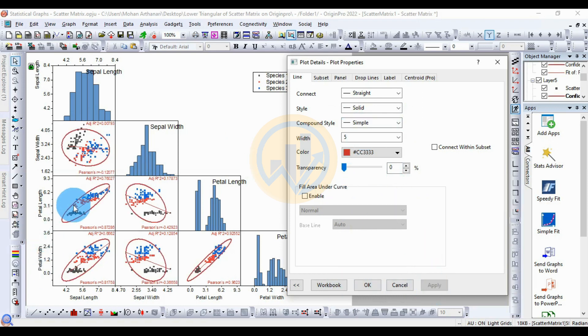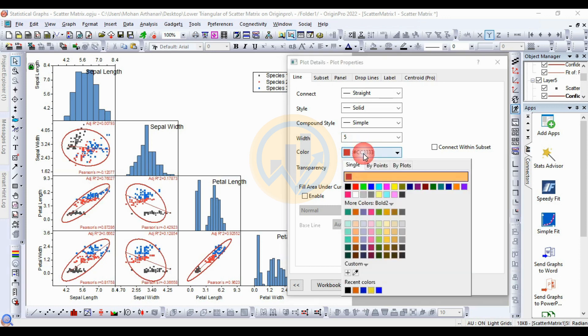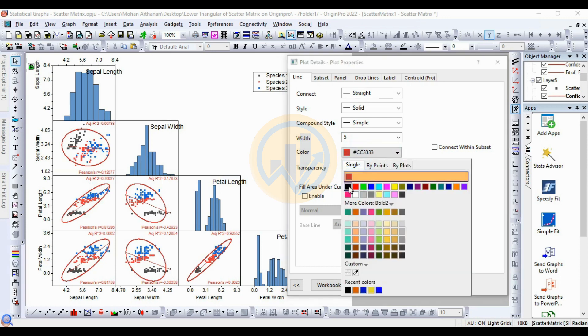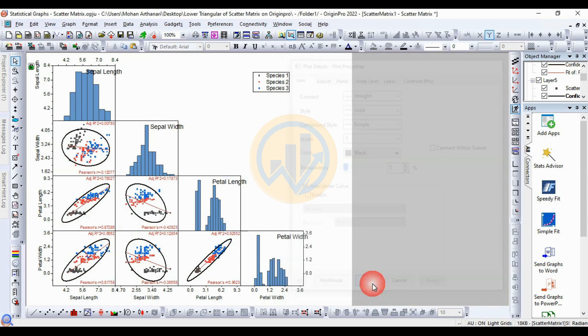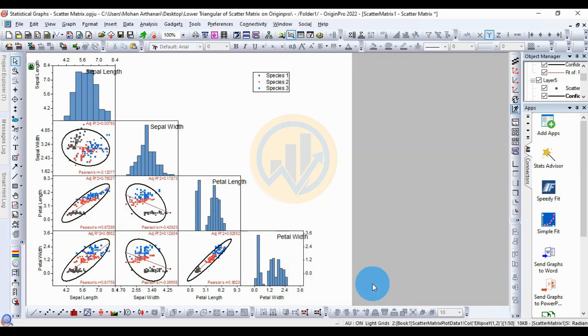Next, change the line color to black using the color menu. Click Apply — the color changes to black. Then click OK. The next step is to customize the linear fit lines.